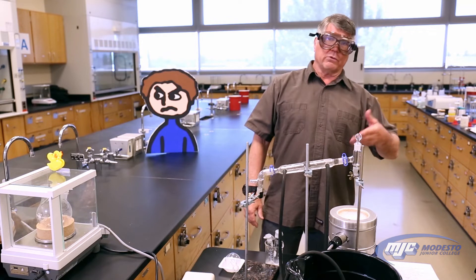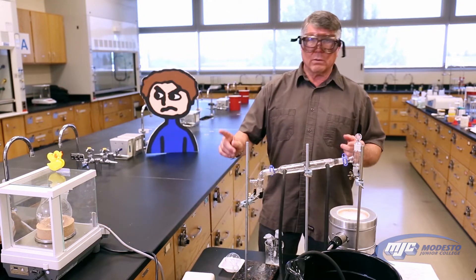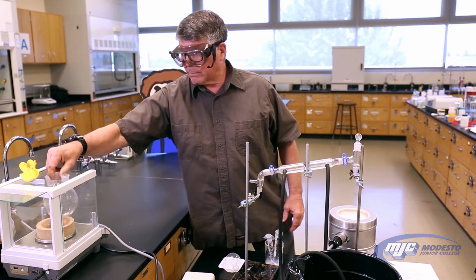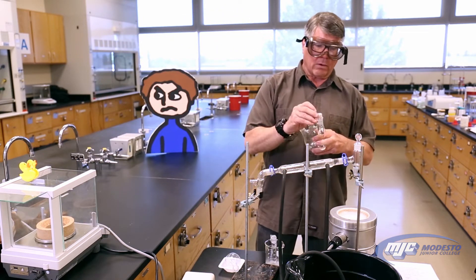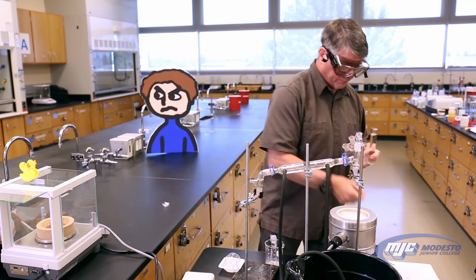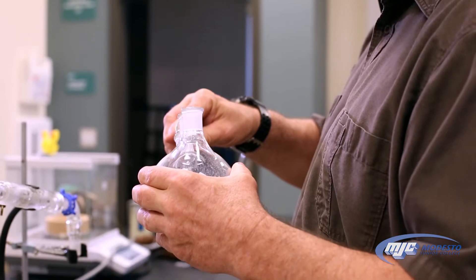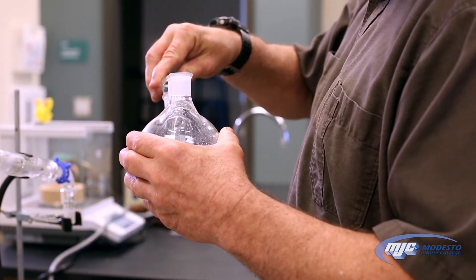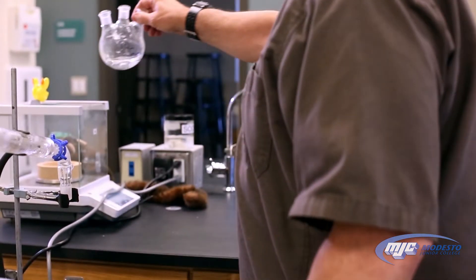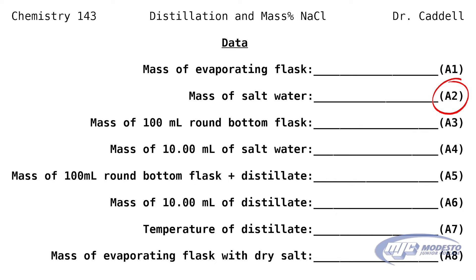Now what we're going to do is put the solution in there and get the mass of the unknown solution. So we're going to tare out the flask with the cork ring — now it says zero with the flask and the cork ring. Take out the flask and add all of our unknown solution to this. It's an unknown, so it has an unknown number, so we're going to tape that in our data table. Pour all of our solution into our tared evaporating flask. Put it back on the balance on the cork ring. That mass there is our A2, mass of salt water.